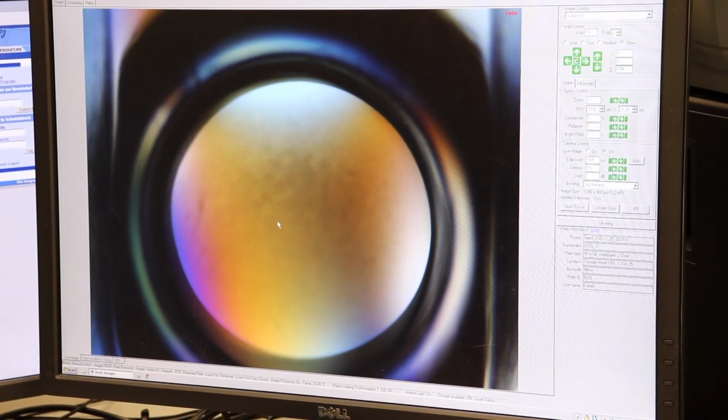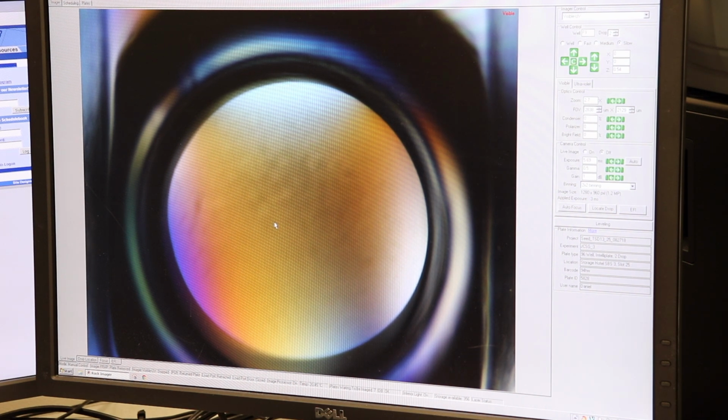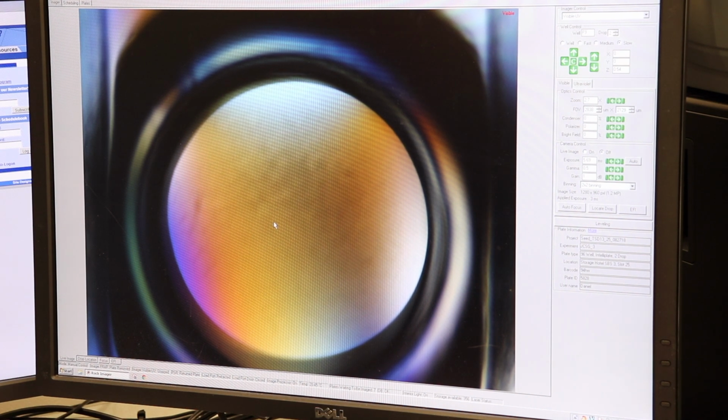Okay, so now we're going to image just interesting drops using visible and UV high definition. Typically, you only want to use the UV high definition to image individual wells. It's extremely inefficient to image the entire plate with UV high def every time. It takes about an hour per plate and uses up a lot of storage, and really doesn't help you unless you think there's something in that well already.